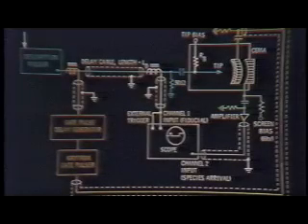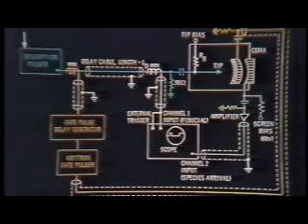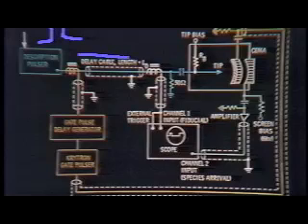Now, to appreciate the instrumentation, and I won't show you any pictures of instruments, but I'll show you a schematic. Remember, the way we do this experiment effectively is we apply a high voltage pulse from this desorption pulser. We allow it to travel down to the tip. The specimen is called a tip. We capacitively couple it so that we can put a DC bias on top of it as well.